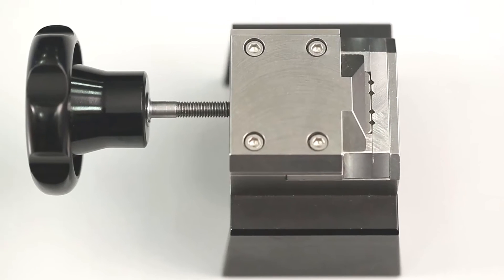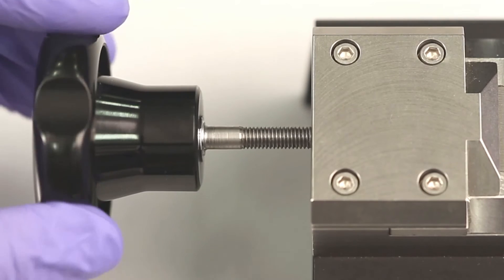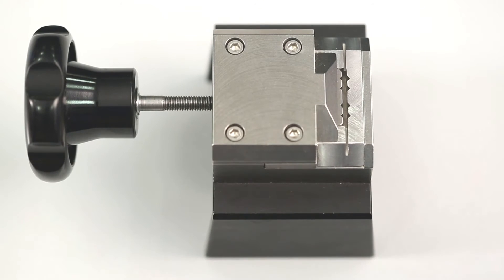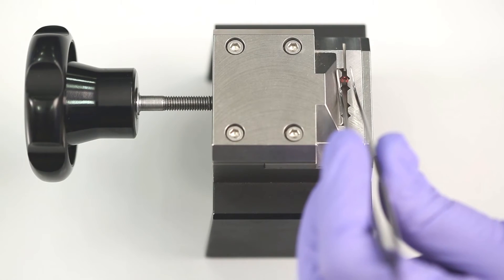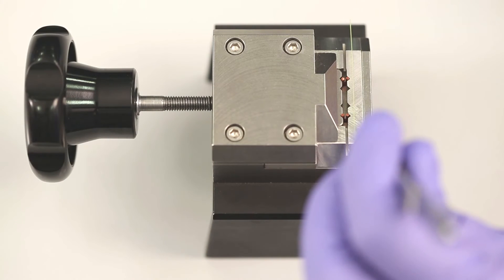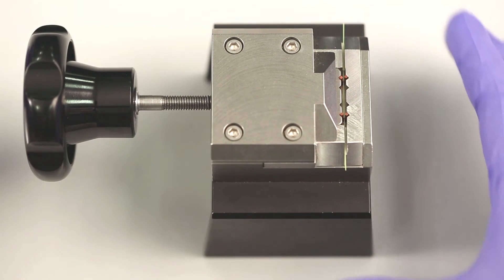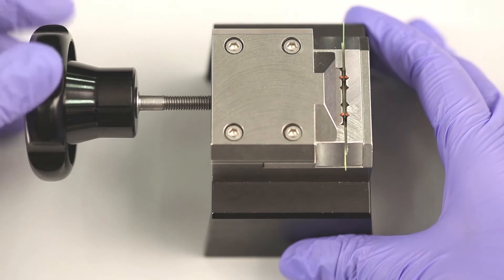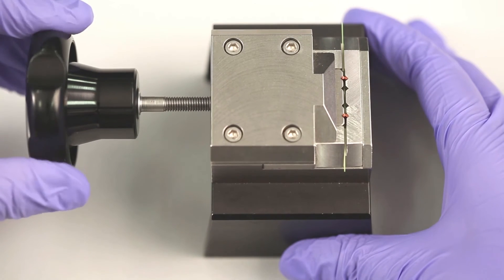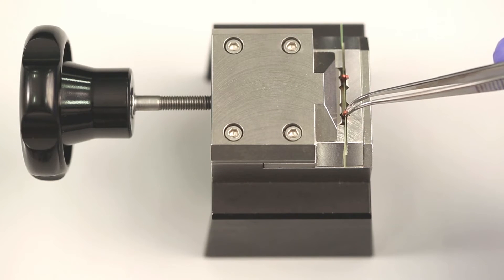Loosen the screw to widen the gap. Ensure that the gap is wide enough to insert the stirrups, which are copper clips coming as U-shaped wires. Cut off a piece of textile fiber of at least 20 mm in length. Insert the stirrup in each of the two notches of the clamping tool. Place the piece of fiber in the gap of the clamping tool. Make sure that the fiber is positioned between the two ends. Tighten the screw to clamp the fiber between the ends of the stirrups. Make sure the two ends are firmly closed, then loosen the screw and remove the fiber with the attached stirrups using tweezers.